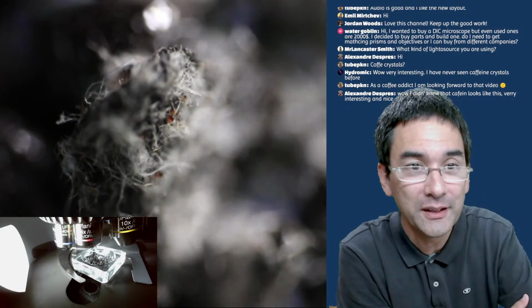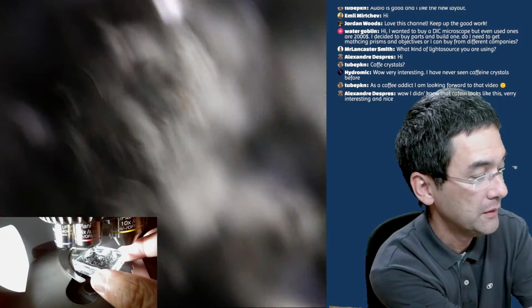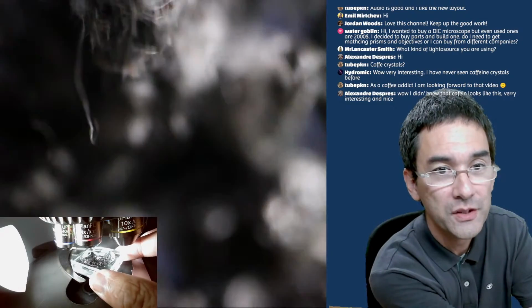So I just wanted to show you that it's quite nice and quite easy to observe it. So if I move this around a little bit.